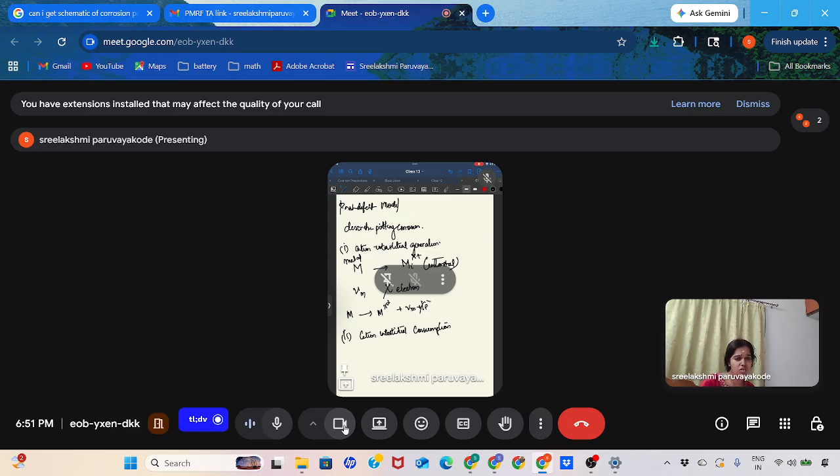So it's some kind of oxidation state like chi plus or a higher oxidation state happening. If the dissolution is oxidative in nature, then we can say that current is generated. Here also, same as before, film thickness is not changing. There's a continuous supply of this happening. So it goes from the interstitial into the solution. So there's a reaction that is happening.